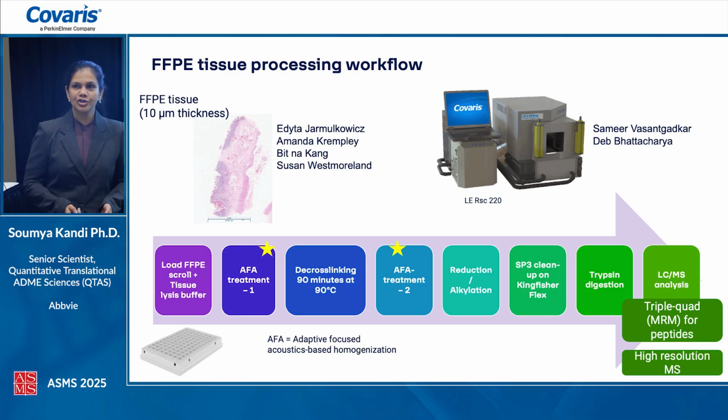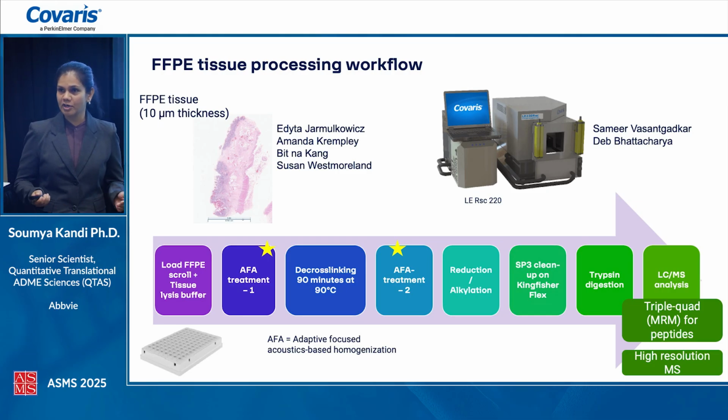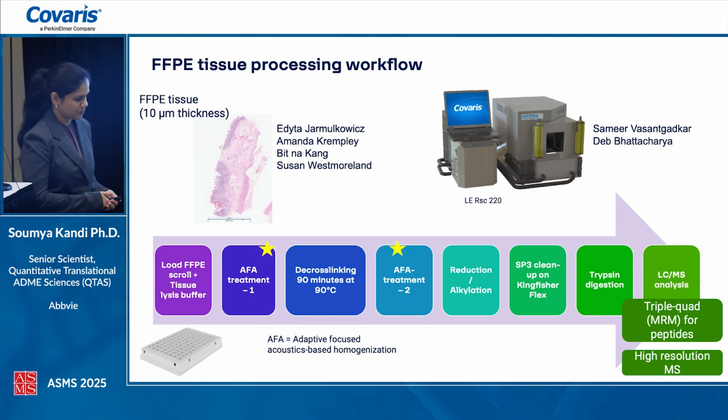So today, I'm going to show you two kinds of data, one that comes from a triple quad instrument, and then another that is from a proteomics dataset.